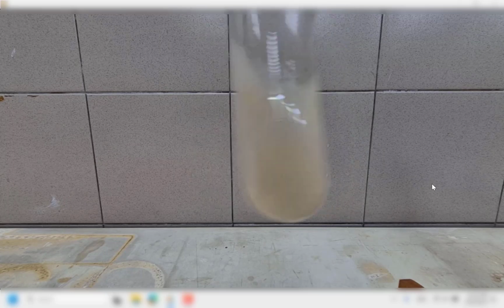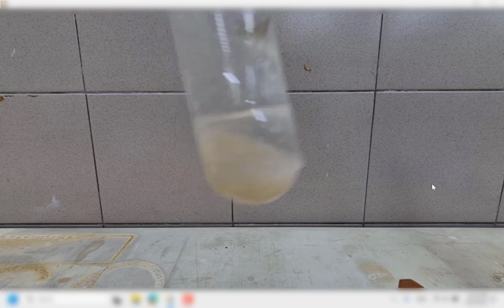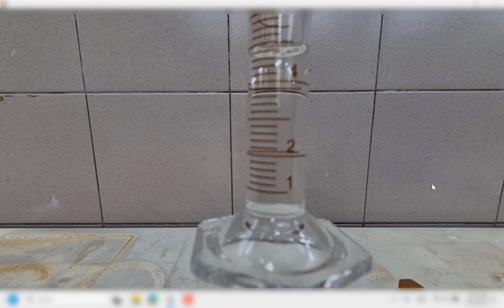Okay, so later on you need to continue observing the wall. Observation here you might want to write will be white PPT, some of it turns brown, etc. So you need to have that kind of in mind. Then after that we'll continue to add in more sodium hydroxide.